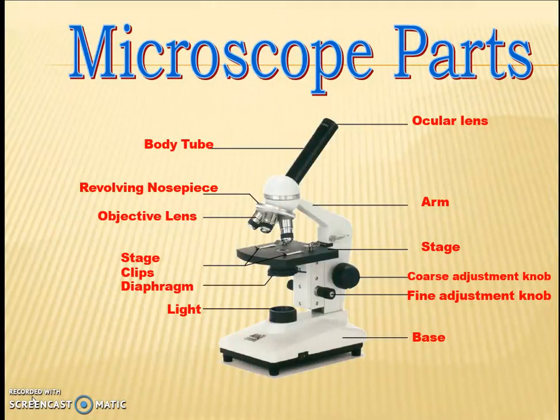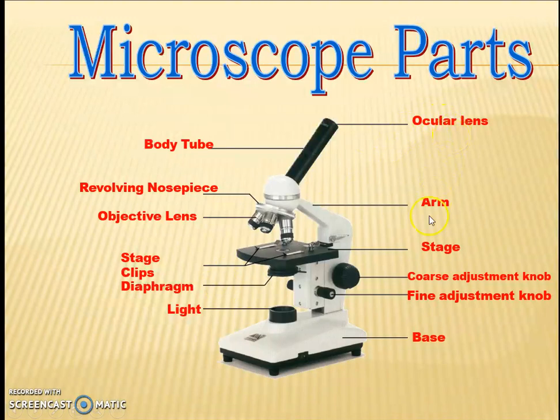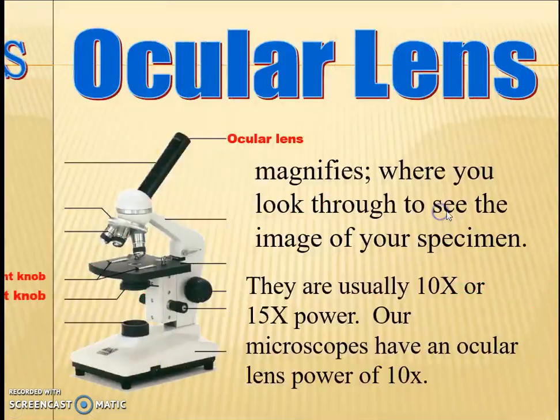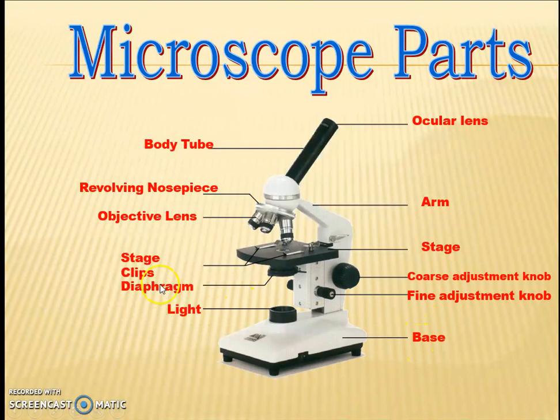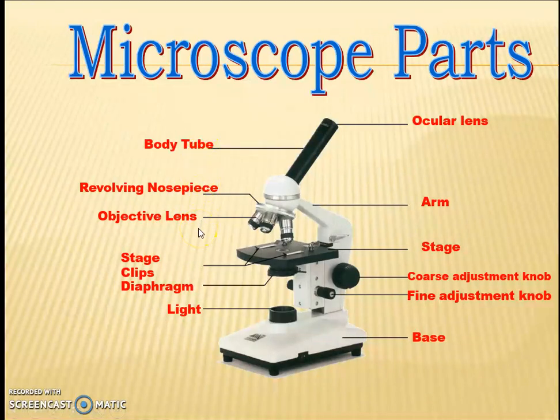Let's look at the different parts of the microscope. Starting with the ocular lens, arm, stage, coarse adjustment knob, fine adjustment knob, base, light, diaphragm, stage clip, objective lens, revolving nose piece, and the body tube. Let's look at these structures in detail and what they are for.